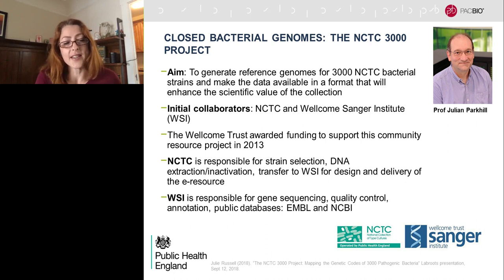So switching gears a little from parasites to bacteria now. Some of you may already be familiar with PacBio because of our work with bacterial genome assembly. And I wanted to highlight one particularly interesting project that was completed recently with the Wellcome Trust and the NCTC.